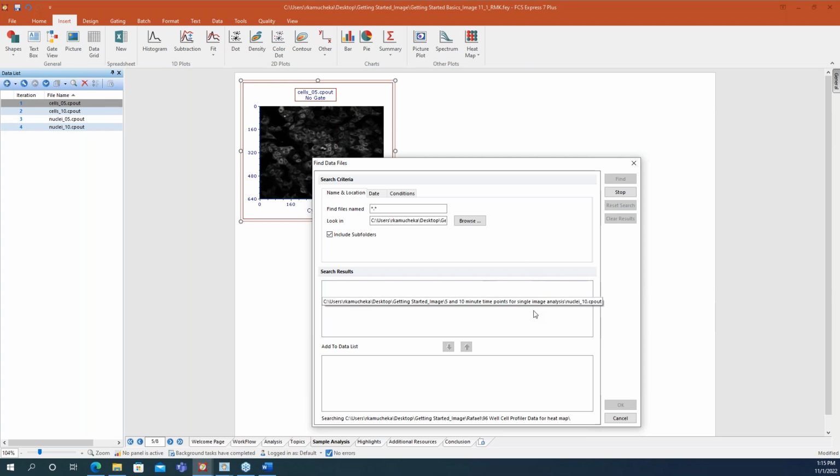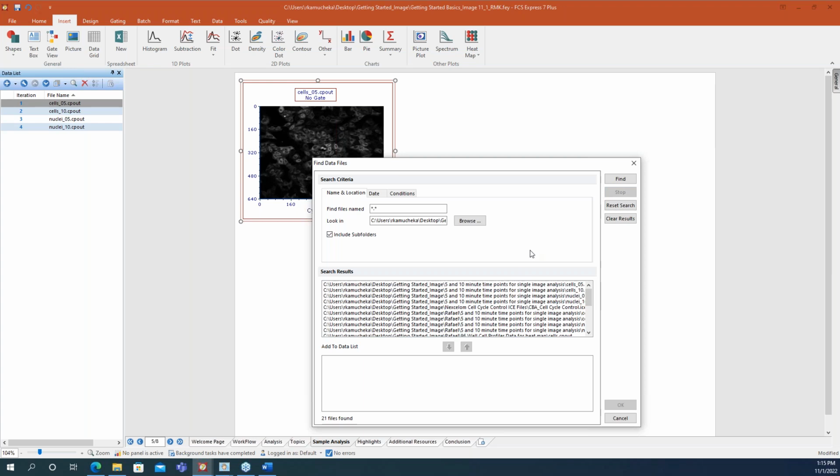It might take a moment to think here. I have quite a few folders and information there, it looks like. All right, I'll go ahead and stop that search.